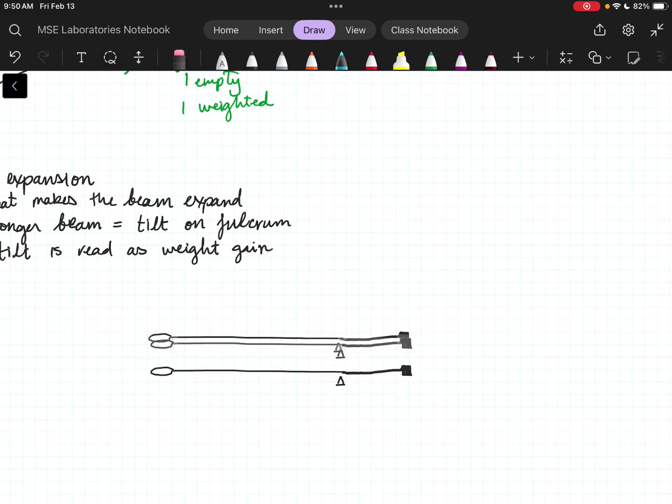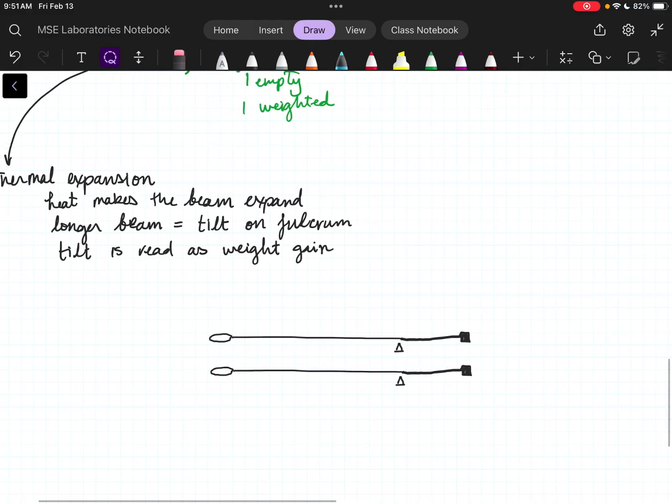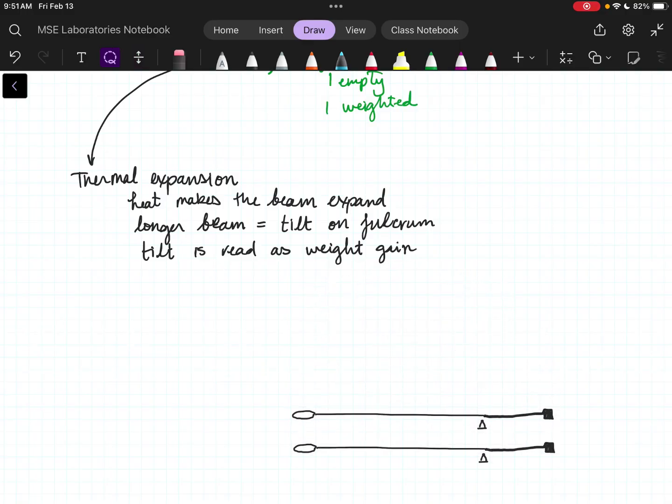All right. We are going to talk about ours as a combo instrument. Most people, this is not going to make a difference to them, because if you have a standalone TGA, no matter which orientation, not all TGAs are going to be combo instruments. But ours is, and so you need to understand the combo instrument situation.